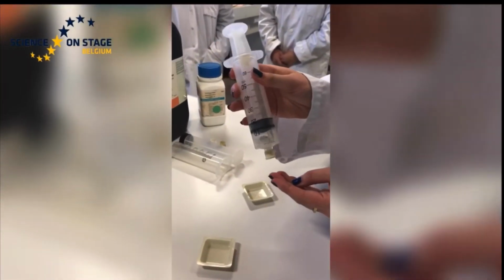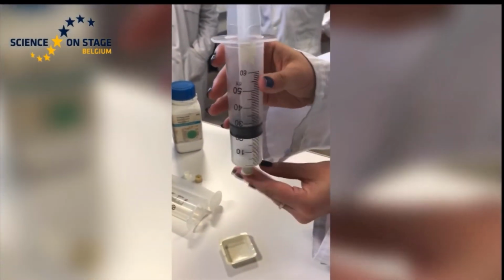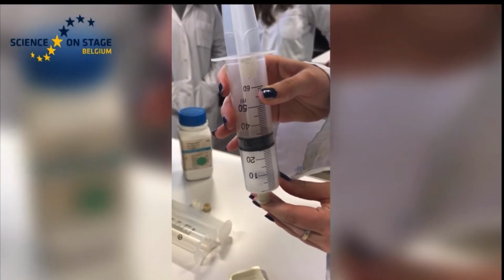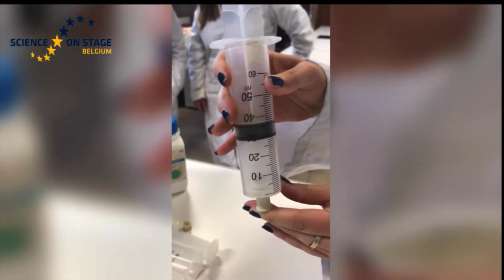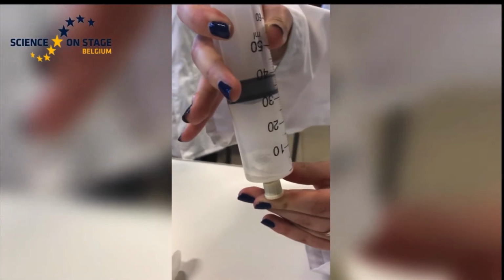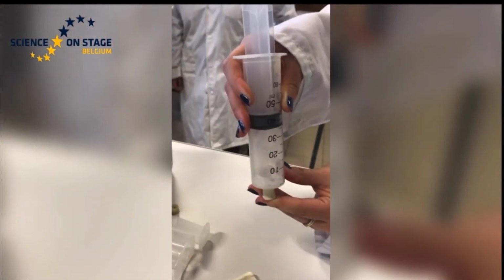The reaction is started by shaking the syringe. The sinking of the boat allows the magnesium to meet the acid. We see that the piston rises by itself. We see an effervescence, bubbles on the magnesium, which disappears gradually, and a release of heat. Next, the liquid must be removed. The excess acid and the magnesium chloride form in solution.